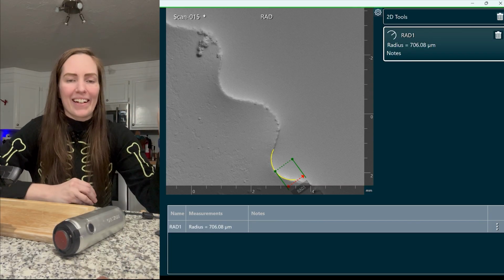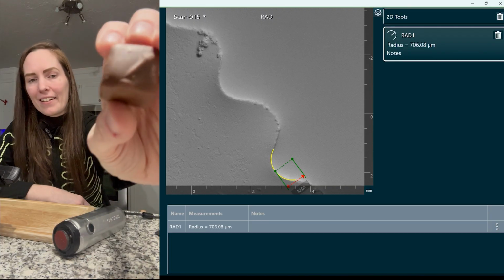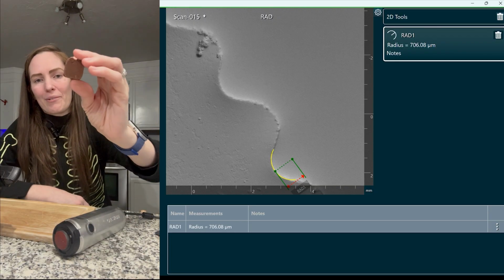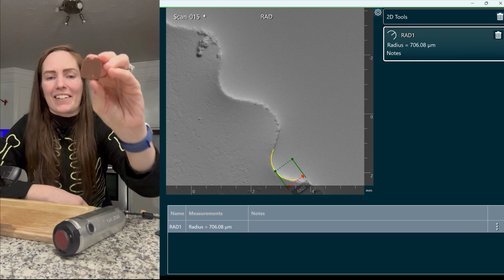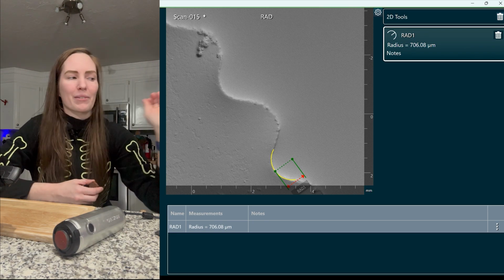So the next piece of candy that we'll look at is going to be a Snickers. I've already taken it out of the wrapper here too. And what I really wanted to look at is actually the texture on the bottom. It's kind of an interesting texture. So let's take a look at that from the capture page again.